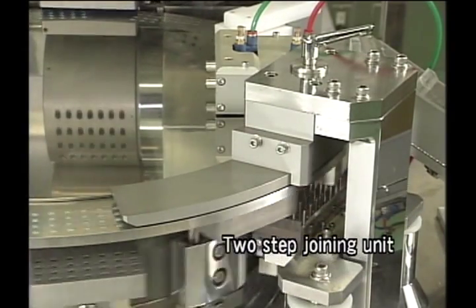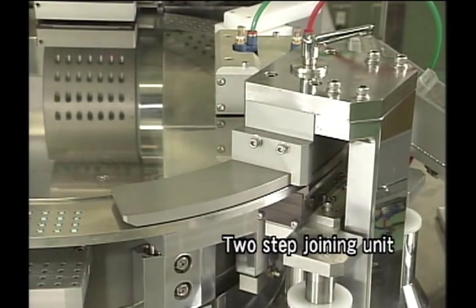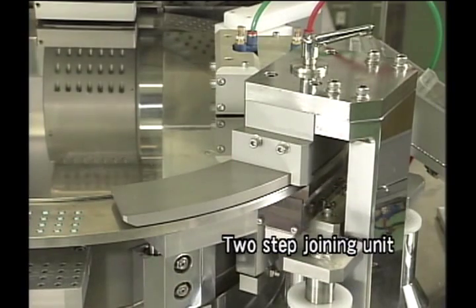After filling, the cap and body of the capsule are joined in a two-stage process by a pusher. This prevents the production of defective products that are incorrectly joined.